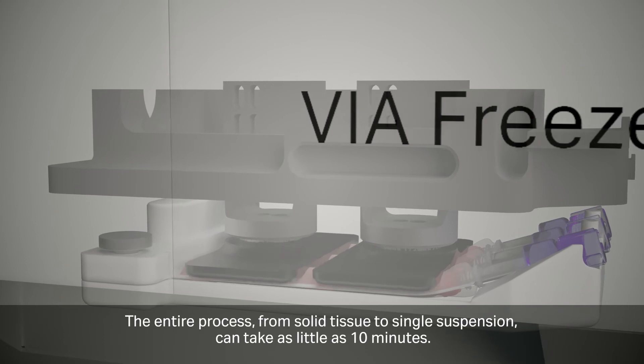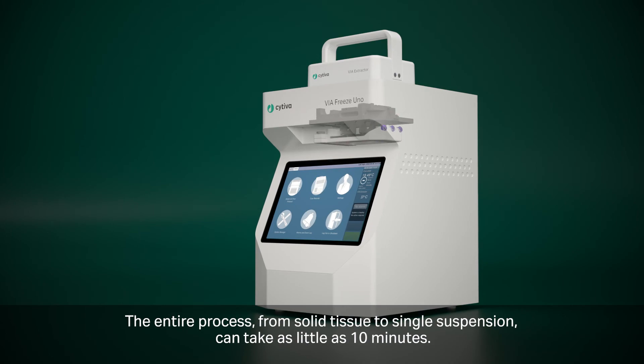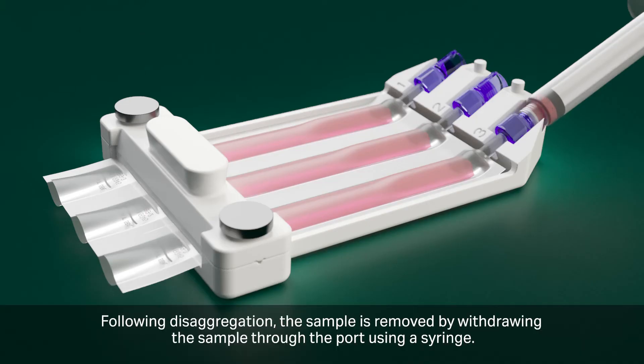The entire process, from solid tissue to single cell suspension, can take as little as 10 minutes. Following disaggregation, the sample is removed by withdrawing the sample through the port using a syringe.